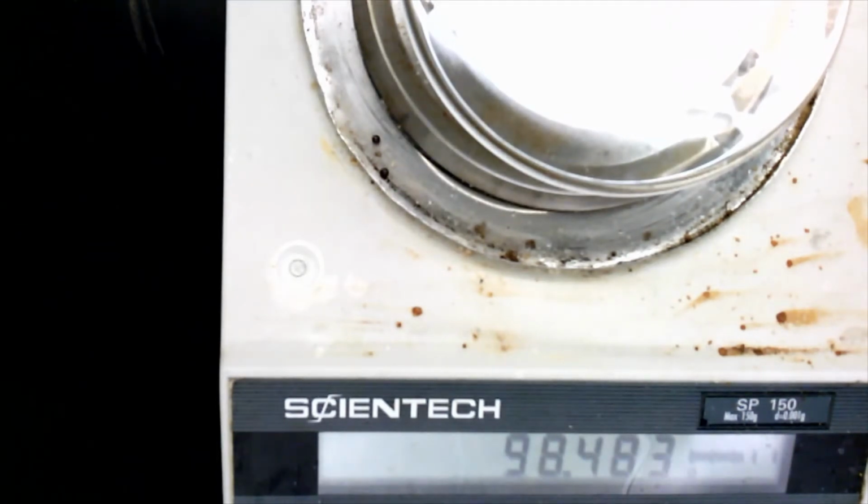Okay, so once that reaches a stable mass, you can go ahead and write that down in your report sheet. That first blank, I'm not going to do this for all of them, but that first blank under procedure A says mass of large evaporating dish and watch glass. That's where this number will go.